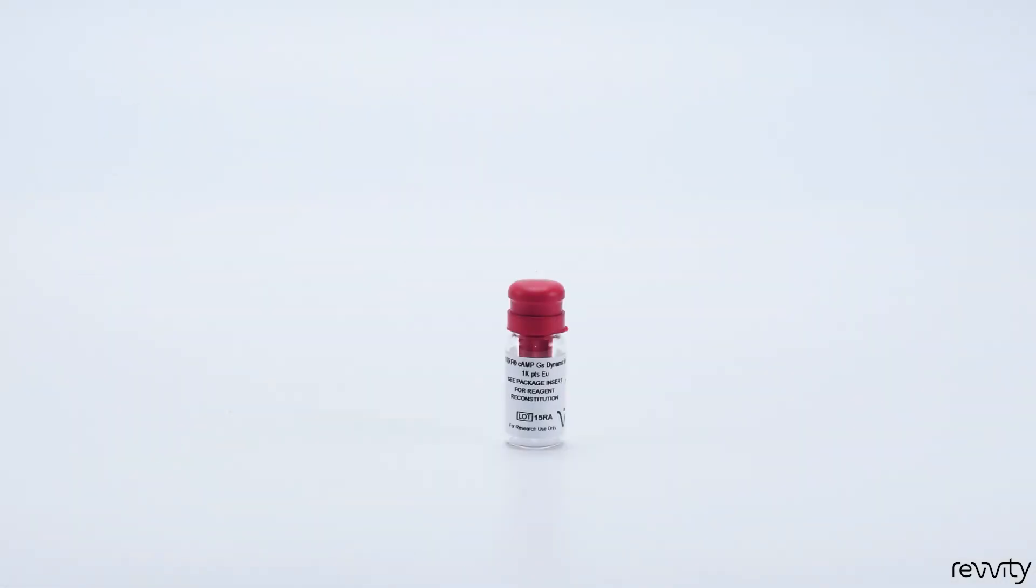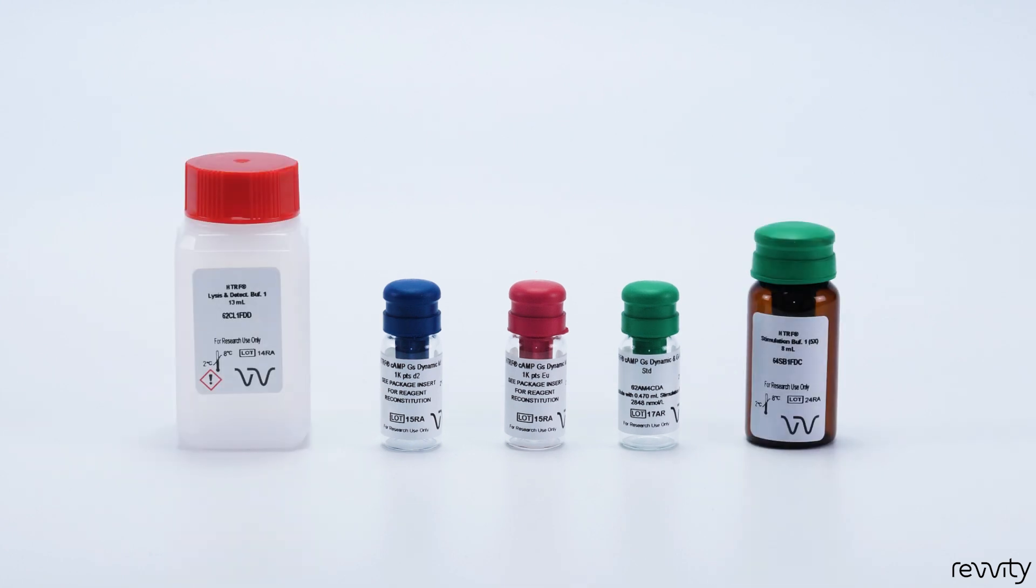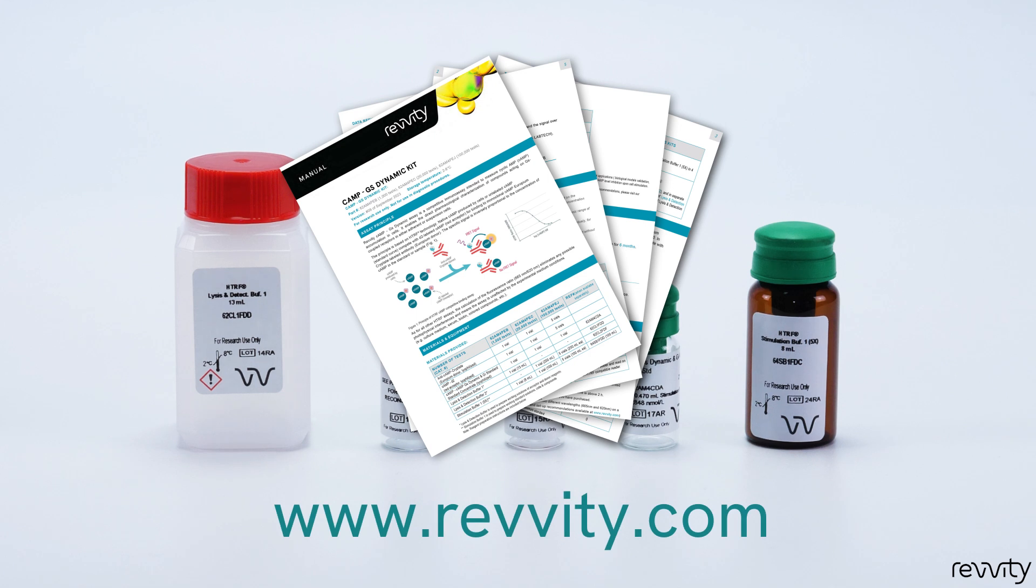The kit includes anti-cyclic AMP donor antibody, acceptor labeled cyclic AMP, cyclic AMP standard, stimulation buffer, lysis and detection buffer, and a protocol which is also available on our website.